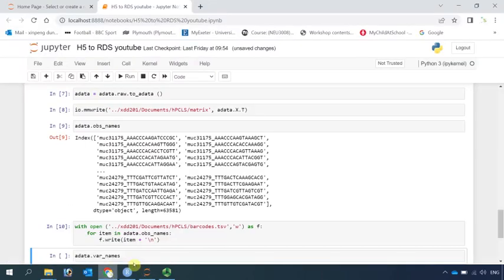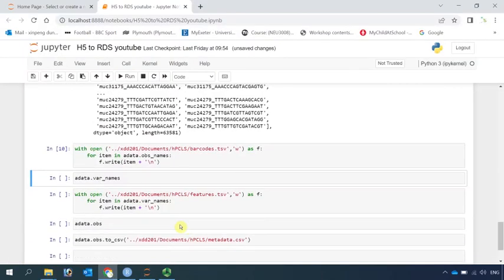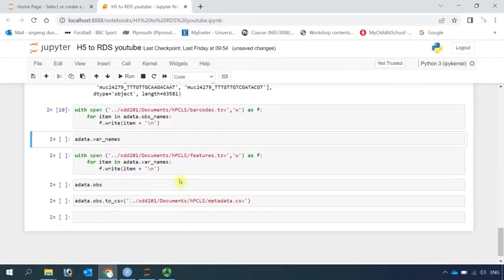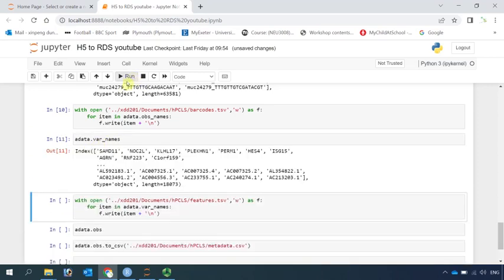Next we need to write the gene information. The gene information was stored in the AnnData variable names. You can see all the genes — we know we have more than 17,000 genes in this dataset. So now we can write the gene information.